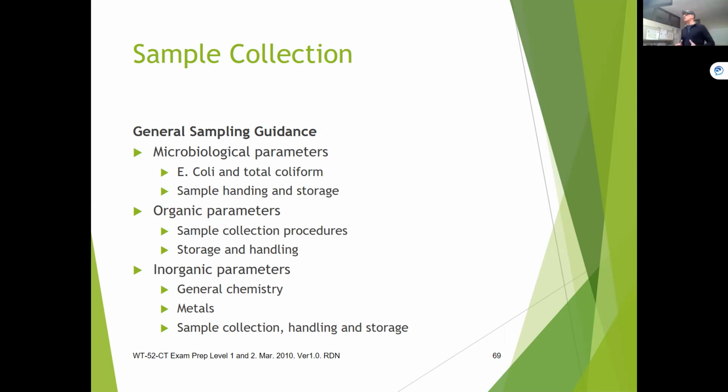Okay, some more general sampling guidance, especially when it comes to the microbiological samples, E. coli and total coliforms. For you as a sampler, we're not touching those threads. We're not putting our fingers on this part here or in here, never ever. That sample's no good; it'd be thrown away.